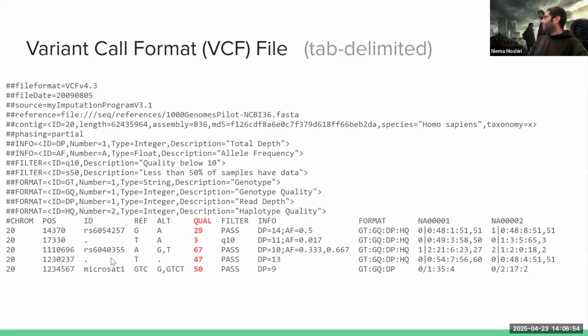Same exact idea here, where based on the coverage, so how many reads cover that position of your genome, based on the base qualities of the letters covering that position, and based on some other probabilistic stuff that goes into this calculation, there could be a quality score associated with that variant call. So the quality of this set of variants on this row, I guess it's just one variant, but the quality of this variant is 29, whatever that calculation is. You don't have to worry about it, but whatever specific tool comes downstream would have to know what unit this is in, which could be different depending on what tool you're using. But basically some metric saying how confident you are that this is indeed this variant.